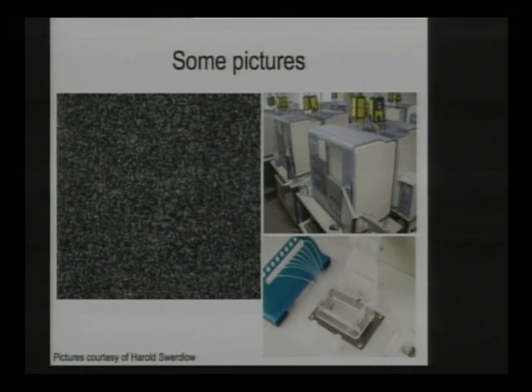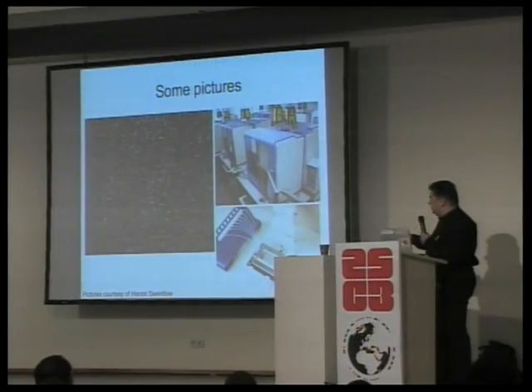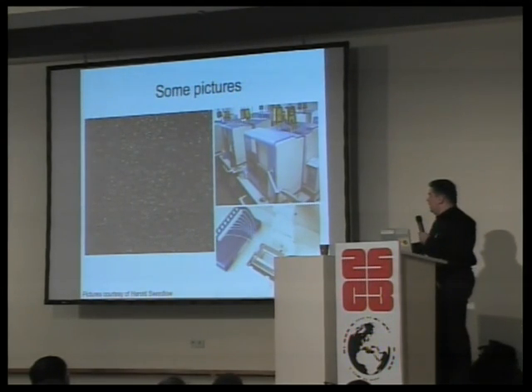To the right, you see the Solexa machine. So each of these is one machine. And in here is a so-called flow cell, which is this thing here. It's rather tiny. It's like my laser pointer. And photographs are taken from this. So this is a very, very tiny portion of this flow cell.